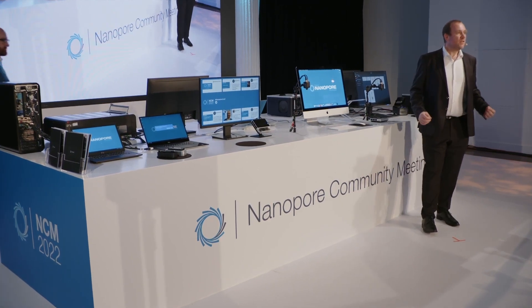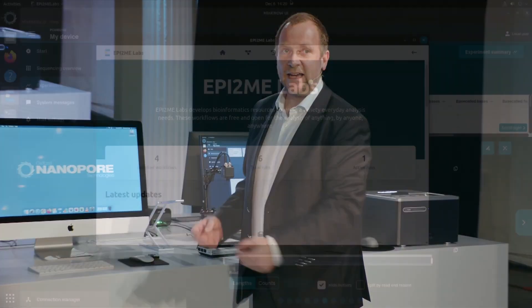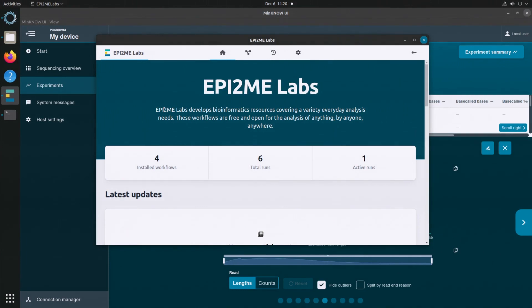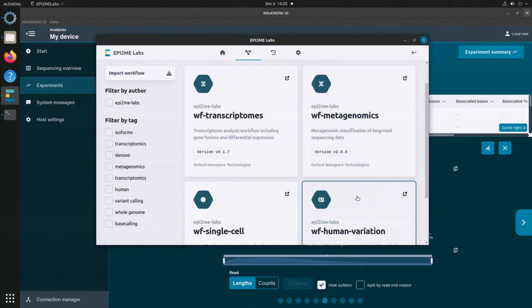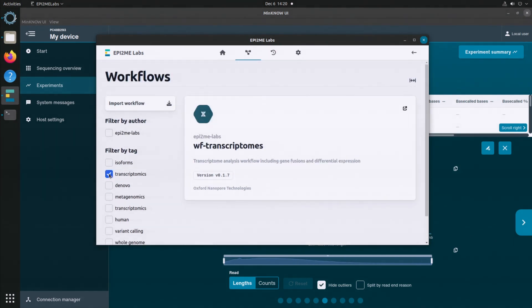Thank you, Rachel. Today we're super pleased to launch a new version of EPI2ME Labs, our software for on-device data analysis. We've seen the MinKNOW software behind generating live sequencing data — now how do we perform the analysis? My colleague Matt is going to open up the EPI2ME Labs software. This is a desktop piece of software that comes configured with a number of high-performance, exciting, and interactive workflows that will get you towards an answer. We've got a collection of workflows that address typical, useful applications you can perform on your sequence data on the device.